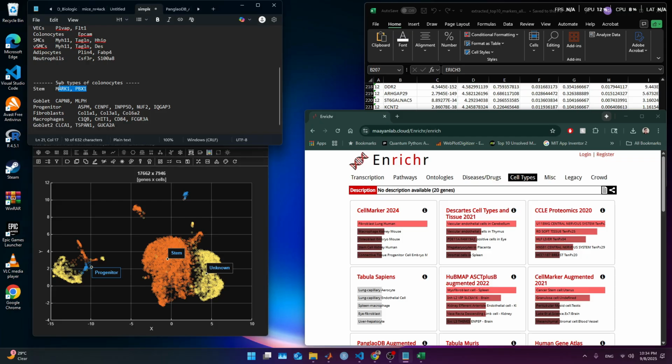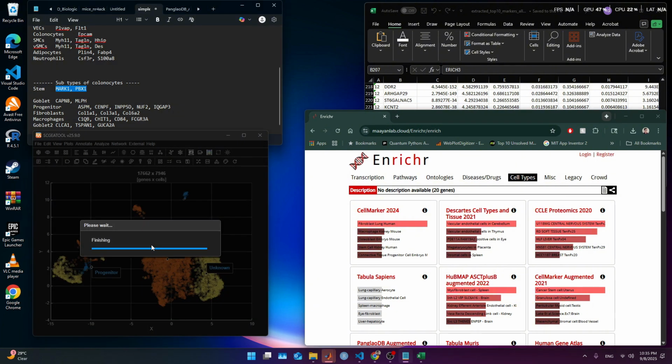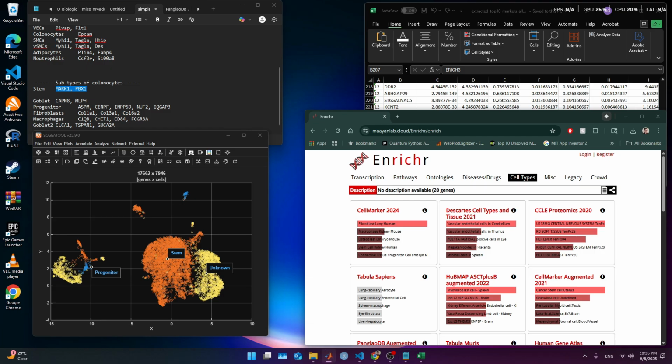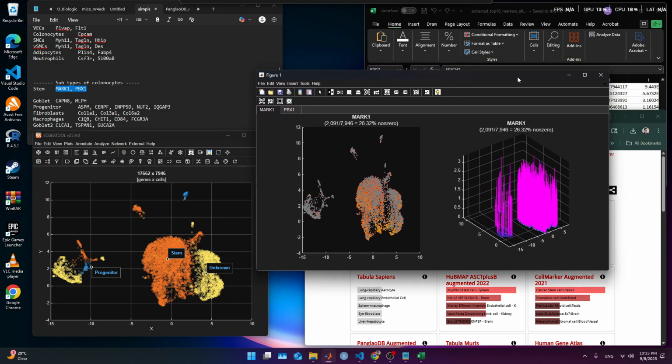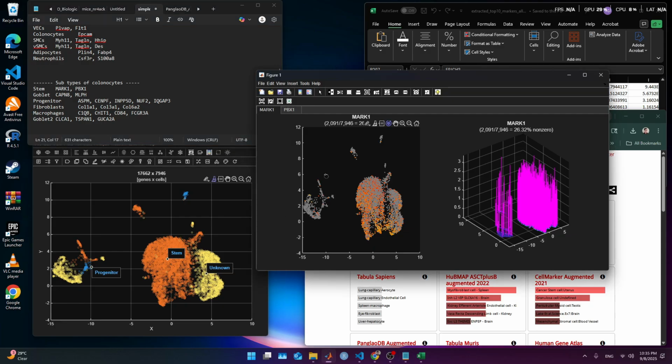Although I haven't looked at the expression of those, and this is something I didn't show before. We can do this expression into the UMAP, and I'm gonna show you something different in short. So it comes out this one. Okay, it's everywhere, but mainly in the right hand side. So I don't know why it call it stem cell over the place. So something is happening here. Then I mentioned before that could be contaminated, and we gotta be sure.